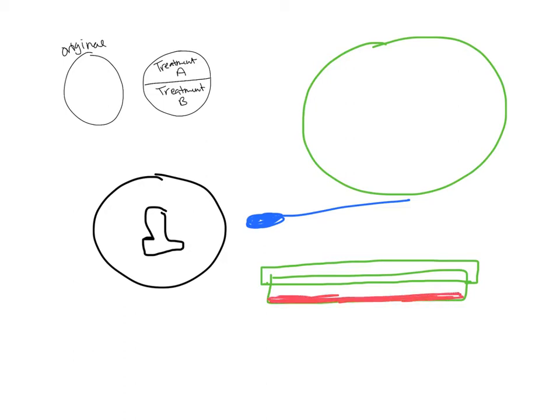It's important to recognize which side of the plate the agar is on as well, because that's the side you want to label on. So you don't label on the top, because if you label on the top it can come off. It does. It comes off. And so you can mix up tops. And I actually have a video linked to online that shows that.